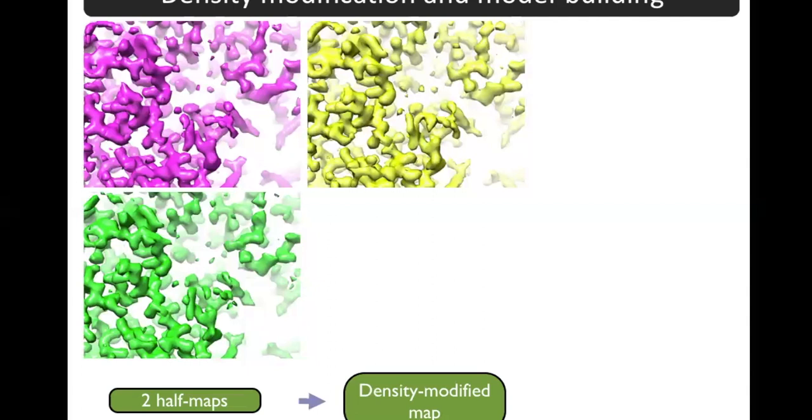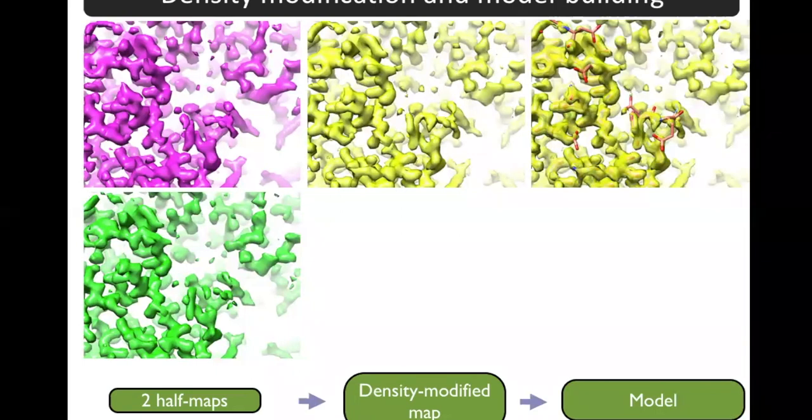Once we have a density modified map, we're going to do automatic model building to create a model that matches that map. And you're going to see that the first run through of automatic model building will work pretty well, but it won't be perfect. There will be a couple mistraced places. And we're going to fix those also automatically by deleting the bad parts and rebuilding the parts that were bad, and doing that using a tool, assign sequence and sequence from map. Okay, so let's go through this.